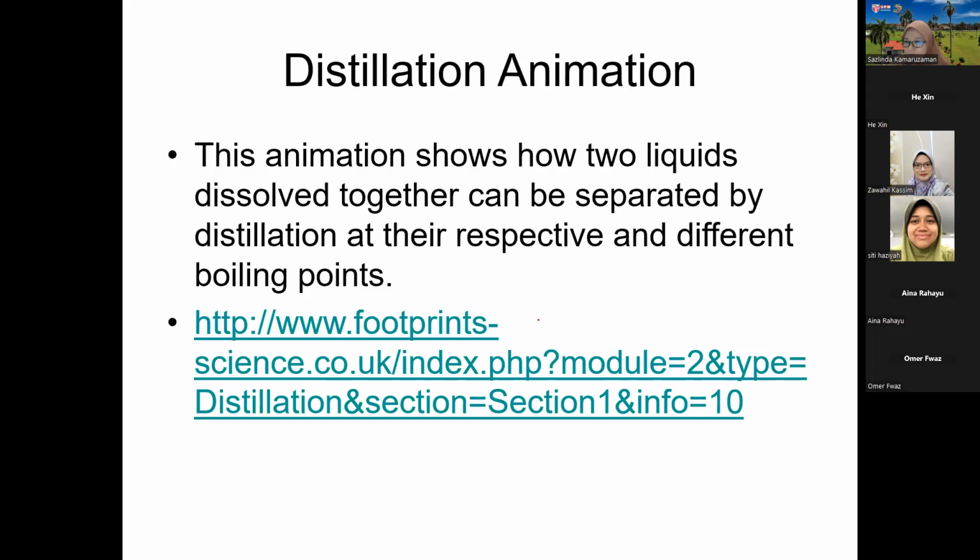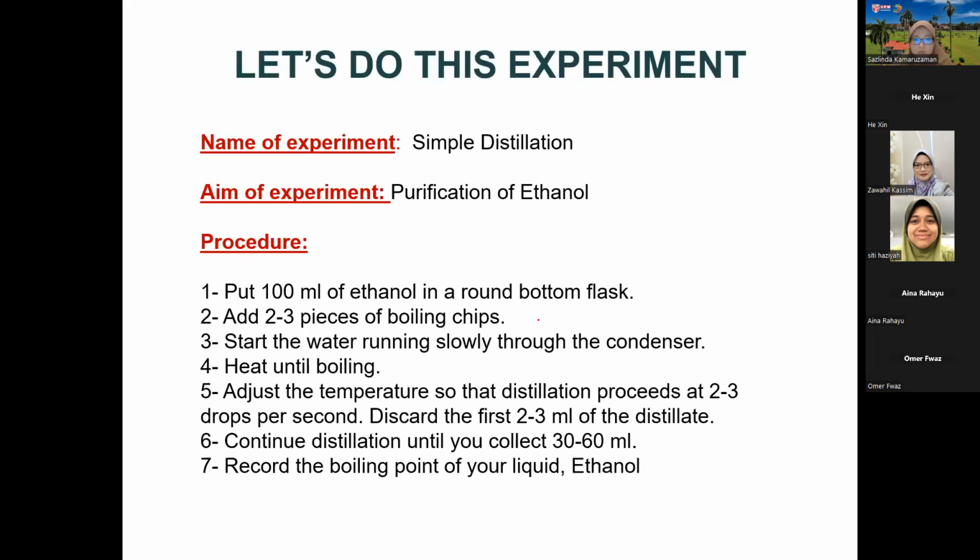If you have time, you can go through them. Sometimes I put in some animation videos, because I believe we are still quite interested in them. Even though we didn't have time to go through them in the lecture, you can click on them when you have free time to see more about distillation. This is very widely used, even in undergraduate study and some master programs. When we introduce distillation, simple distillation is the best example that we can use.